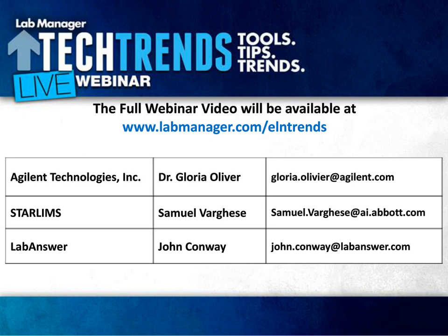Our particular product is specific to our LIMS. We don't sell our ELN as a standalone product, so it's only if you buy the STARLIMS, the LIMS portion, then it would be an add-on to the LIMS. So we don't make it available as a separate application. But I know that there are other companies that do make ELN as a standalone product.